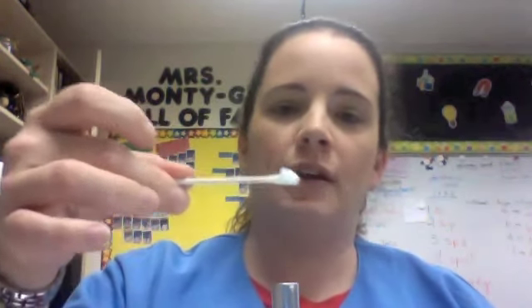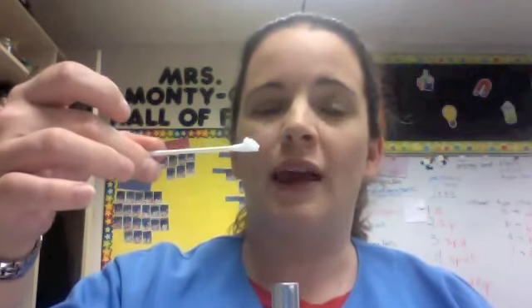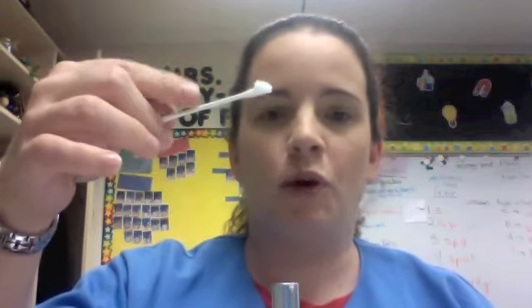So you're putting the Q-tip in the flame to see what color it is. Don't hold it in so long that it catches fire. Okay, you're just looking; you don't want the Q-tip wood to burn. Once you're done, put it into the beaker on your table that says trash. It will go out. It might even have some water in it just to extinguish the fire. No big deal. You're going to do that for all of the different weighing boats at your station to see what colors they represent.